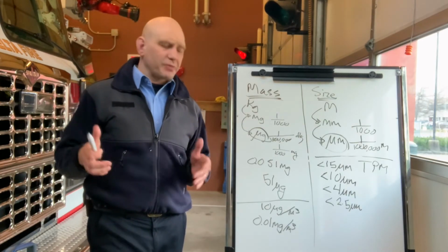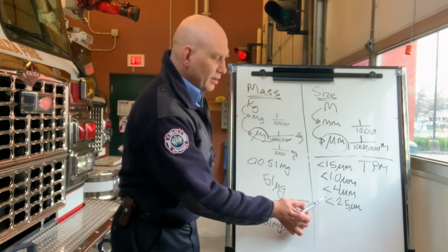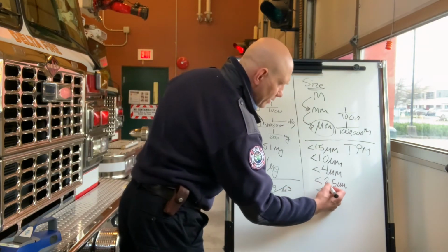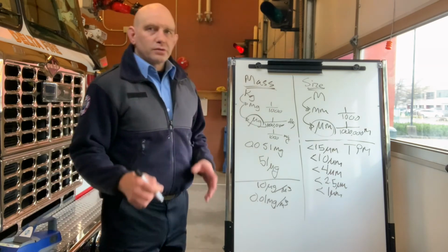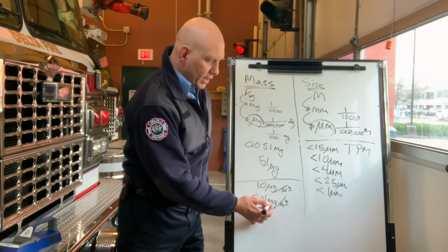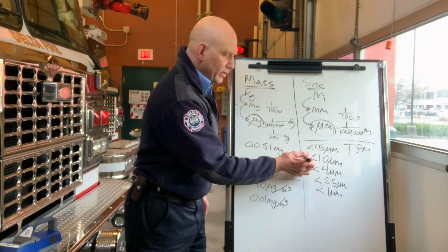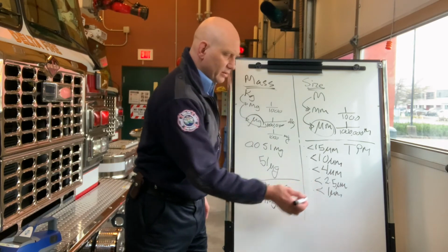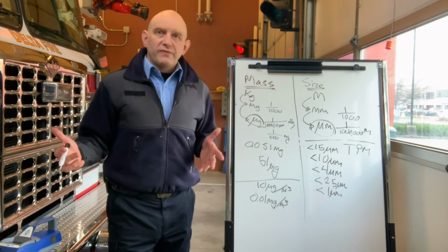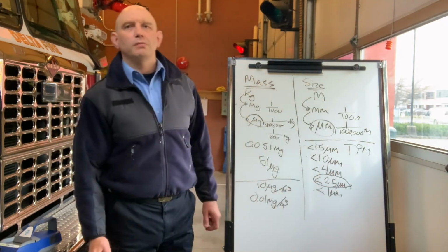They'll give you a value, something like, right now we've got 0.01 milligrams per cubic meter at less than 2.5 microns. The final size we're worried about is less than 1 micrometer. So this is what our detector shows us. It shows us a density of milligrams per cubic meter or micrograms per cubic meter at each of these sizes. So obviously this is going to be the biggest number, that's going to be somewhat smaller, and so on down. And for certain things like, say, air quality advisories, where there's a wildfire and there's smoke all over the place, it'll typically be the 2.5 micron level.